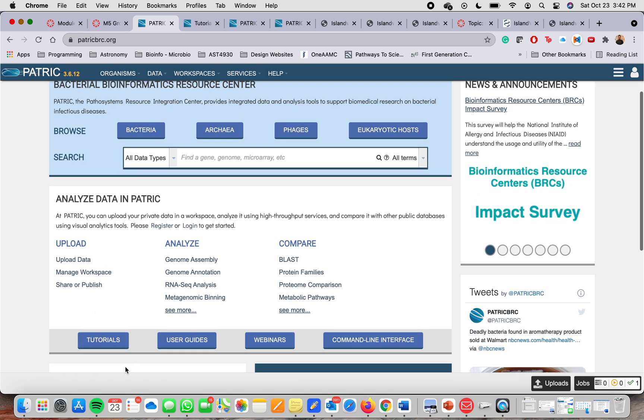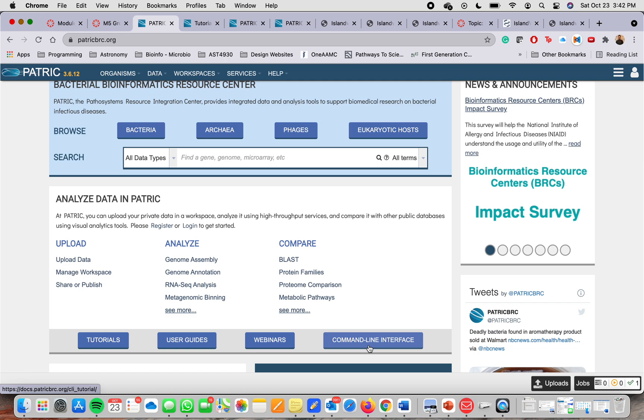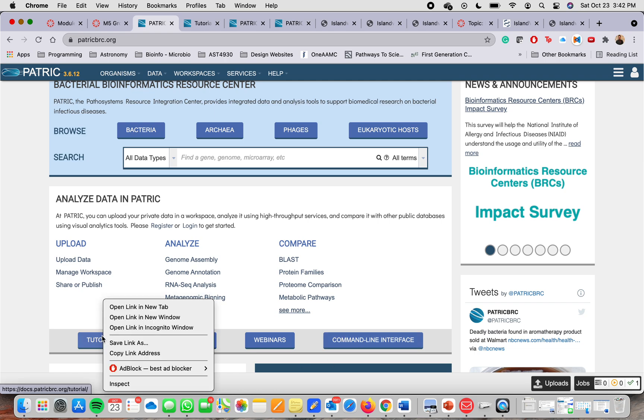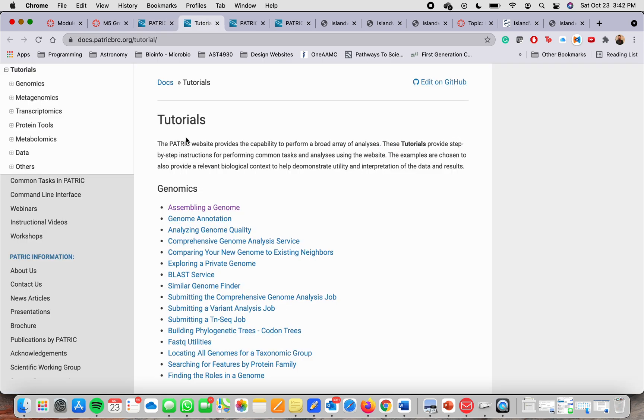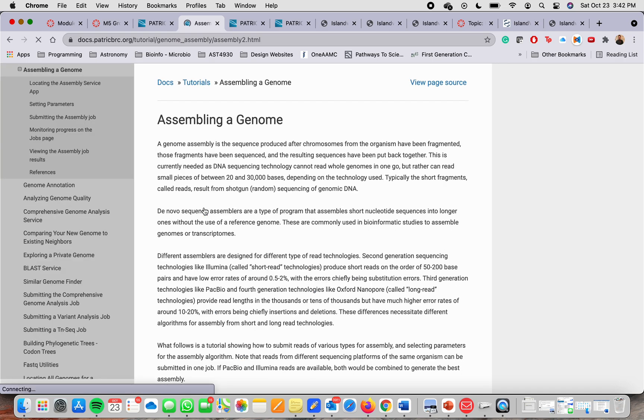You will see down here that you can find the tutorials, the user guides, webinars and command line interface. In case that you don't know how to do something, you open the tutorial, open link in the new tab and it will take you here. And here it will show you step by step how to do anything that you're interested in, like how to compare genomes.